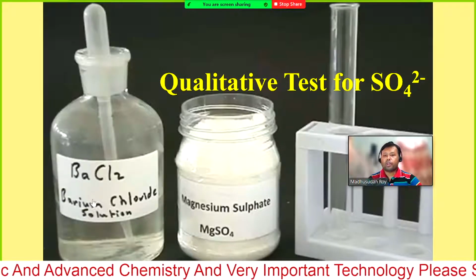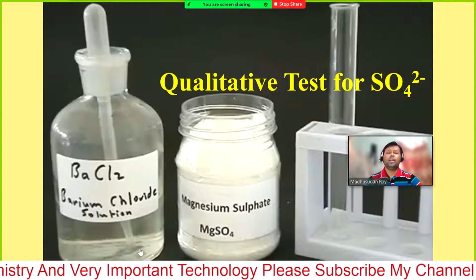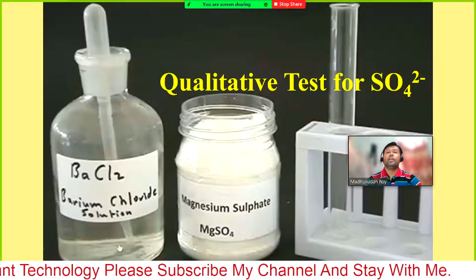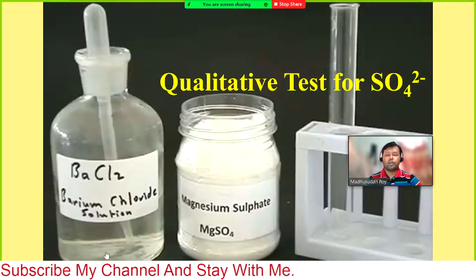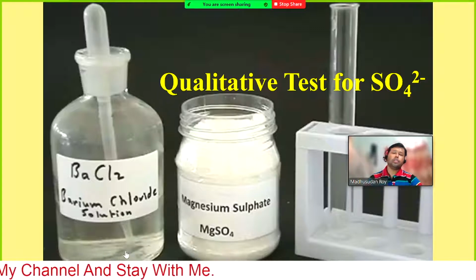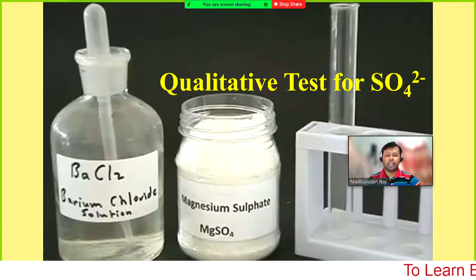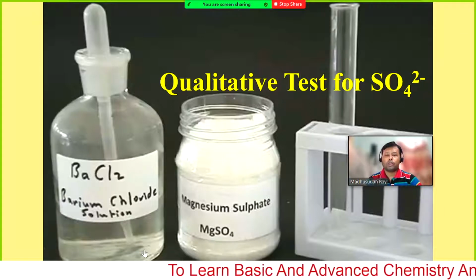This is barium chloride. It has some residue in the bottom. However, you should take the barium chloride from the top. You should not take from the bottom, because barium chloride is not completely soluble in water. If you filter the solution, that is very good, but if you do not filter, then you should take the sample of barium chloride from the upper portion, not from the bottom.